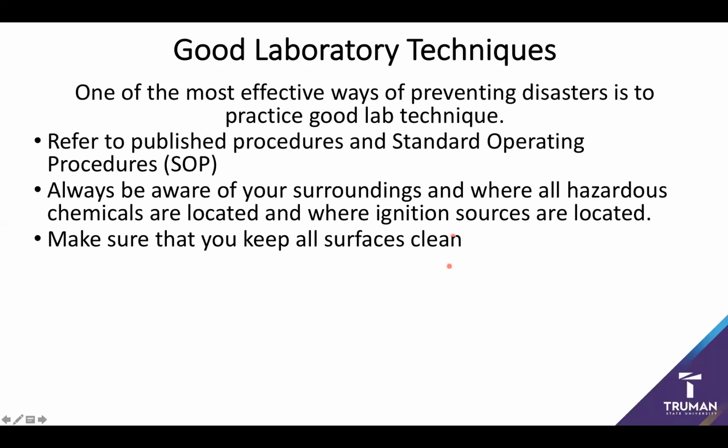And a good example of this is if you go down to the analytical lab, where there are several dyes that have now permanently embedded themselves in several of the countertops or even the balances, and have been known to start spreading to clean containers of chemicals. And a lot of this has been because people haven't been watching out to keep all of their surfaces clean before and in between uses.